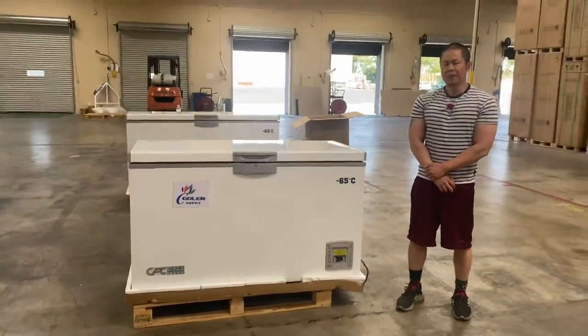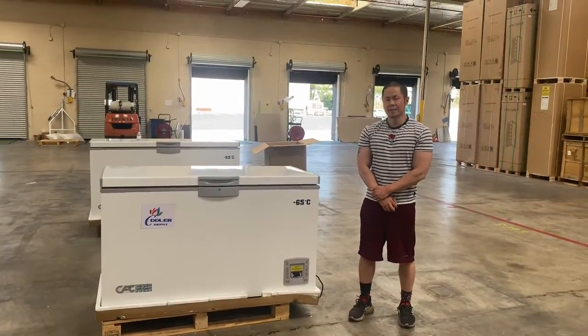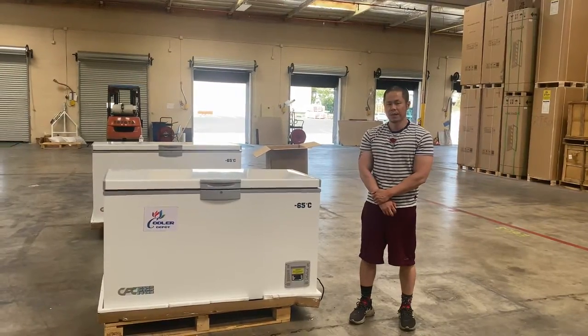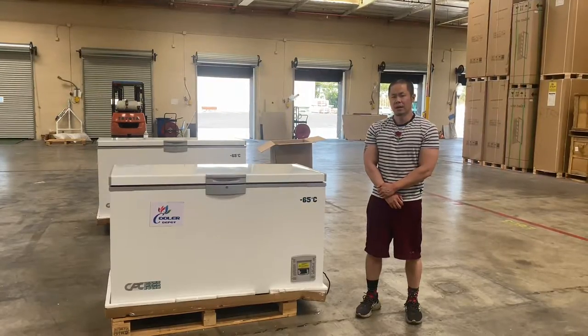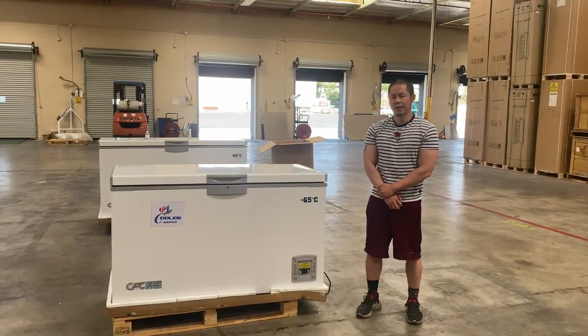This is our negative 65 degrees Celsius vaccine and medicinal storage chest freezer. For any questions, give us a call or visit our website at coolerdepotusa.com. We can assist — thank you.